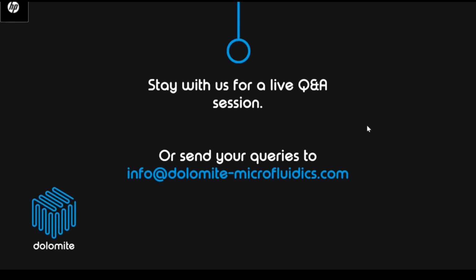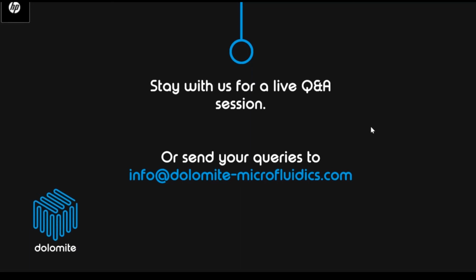I think the question is how the temperature impacts on the production of LNPs. So at the moment with this particular system, we don't have temperature control, but it's definitely something that we're looking into and something we would look to incorporate in, let's say, the next generation. But because our chips are glass, they can very easily be mounted on, let's say, a hot plate, if that's something that you really need as part of your system. And that way you can actually monitor the temperature during the production of your lipid nanoparticles.